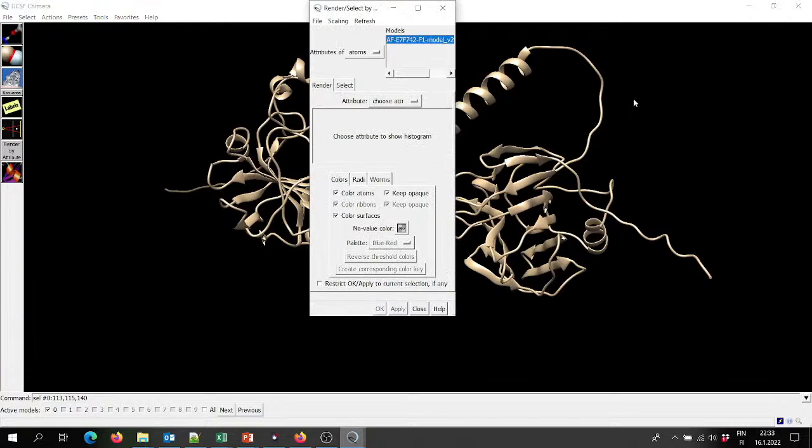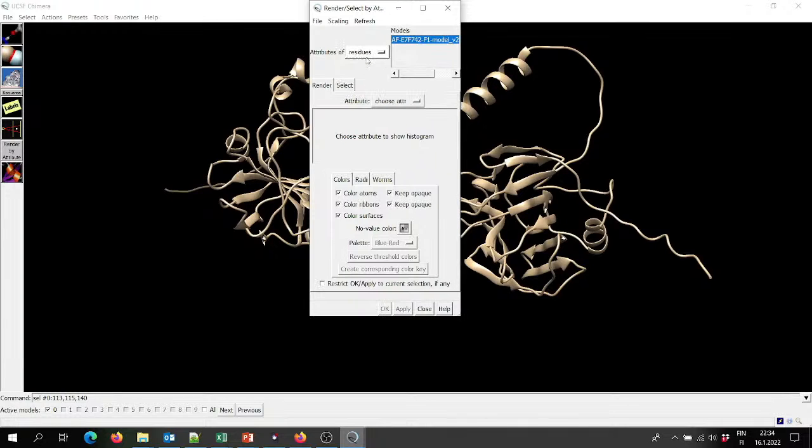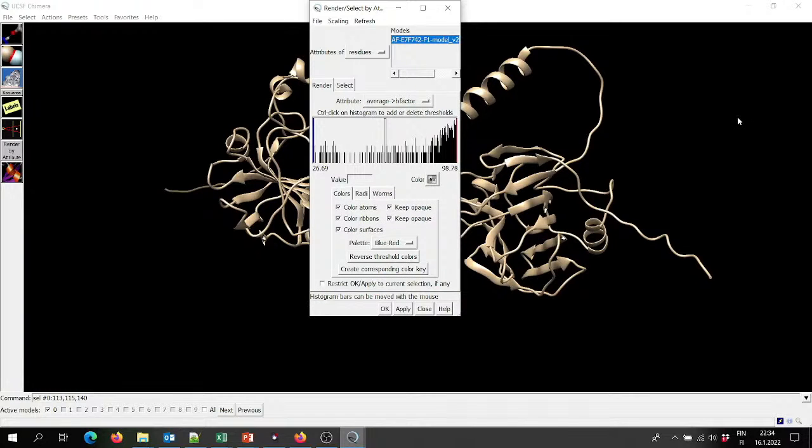Now, crystal structures have the B factors, which model the flexibility, the error of position for each atom and each residue. And now if we look at the properties of residues, we have the average B factor here, but now it's not B factor, but instead it's these reliability values which have been just placed in the B factor column. And in B factors, the small values are good and more rigid, so that's why we have the blue here.